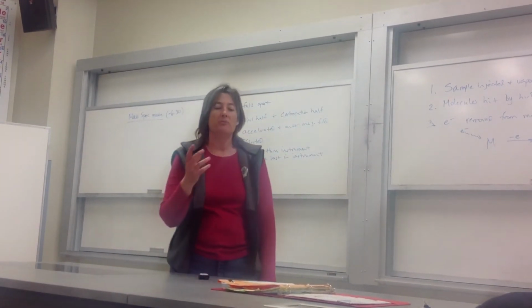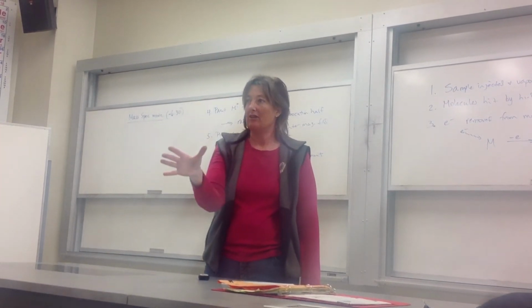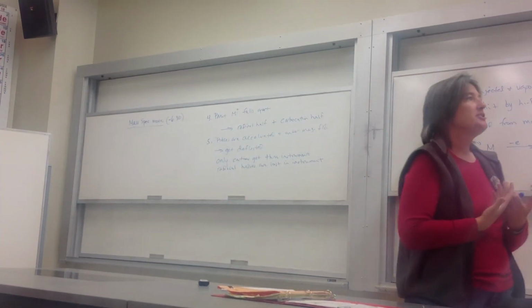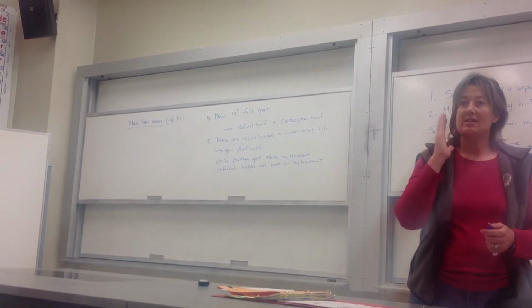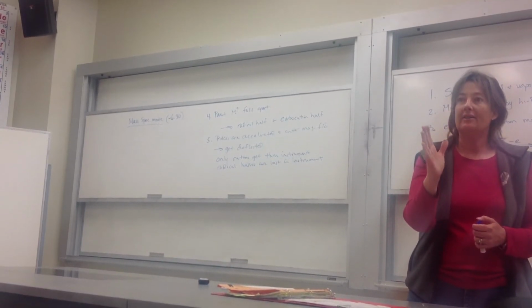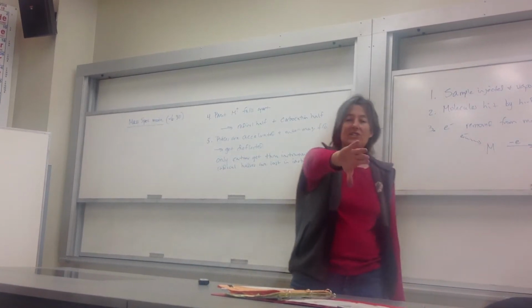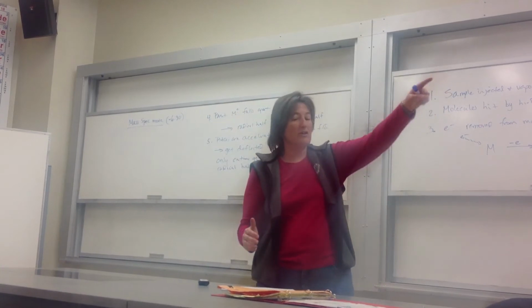When you have a charged particle go into a magnetic field, it gets bent by the magnetic field. And so what happens with the magnet is there is some specific magnetic strength. The beam shoots through the magnet when it's at this specific strength. And the pieces will get bent, they'll get deflected. That's why there's this curve in the tube.